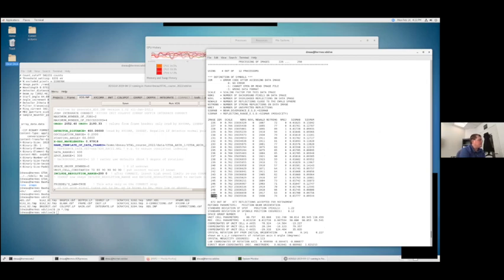Each image is 18 megabytes in size, so you can kind of do the math. How many of these can I open up while still not swamping my RAM? It's giving me the information for one of the jobs. There's also a second job that's trying at the same time to open up 25 images at a time and process them. So you can imagine if I go up to 4 jobs and they're all looking at 25 images at a time, now I'm really starting to hit that RAM hard.